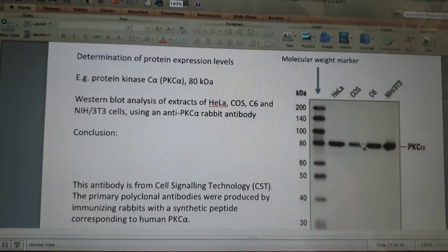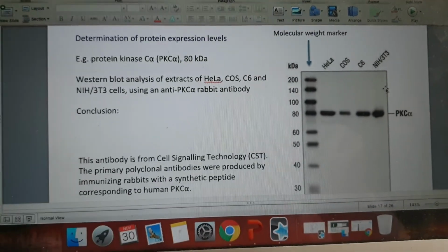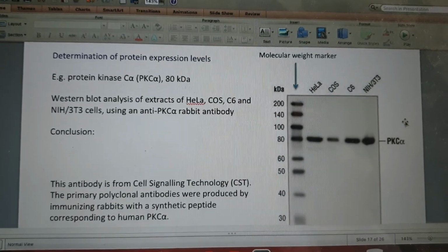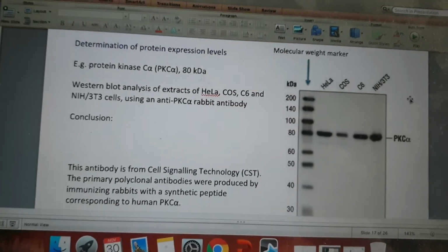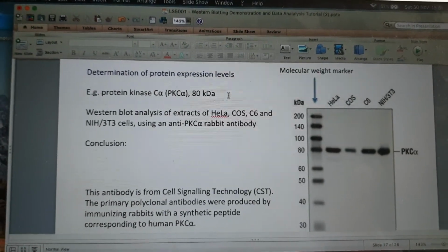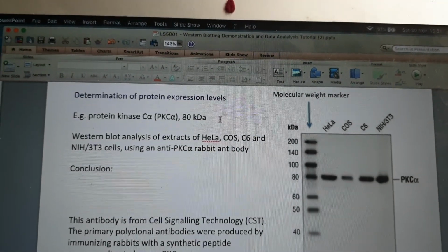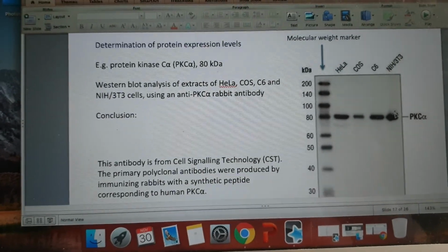But you need to be able to understand this in terms of the primary and secondary antibodies. And hopefully you recognize that the signals we receive during Western blotting come from 3 different types of things. It can be a chemiluminescent result, or colorimetric, or perhaps fluorescence. In the case of a chemiluminescent Western blot result, that would come from the secondary antibody being conjugated with something like horseradish peroxidase, which catalyzes the reaction of hydrogen peroxide with luminol. The reaction produces activated luminol, which is luminescent. And it's that light that is picked up by a digitizer or a photo film. That's how we get these results.